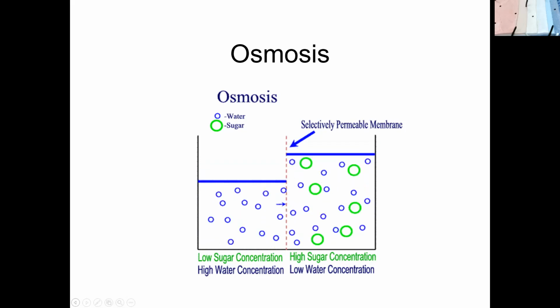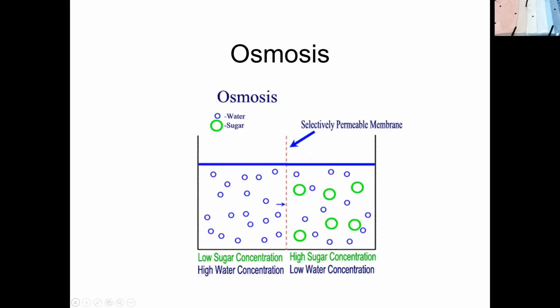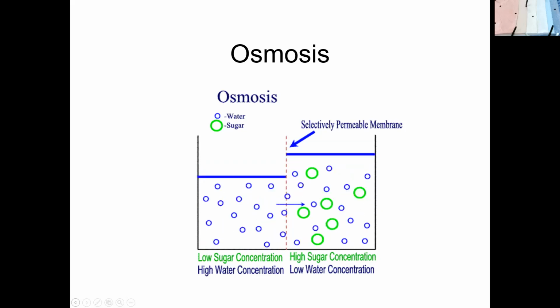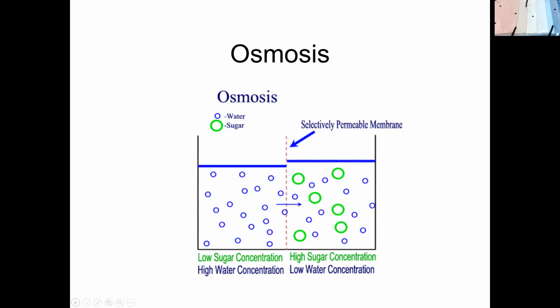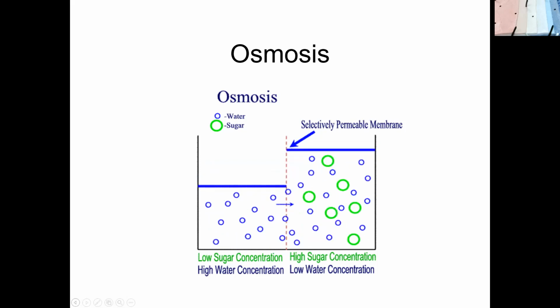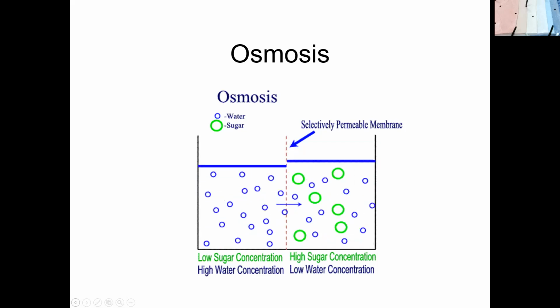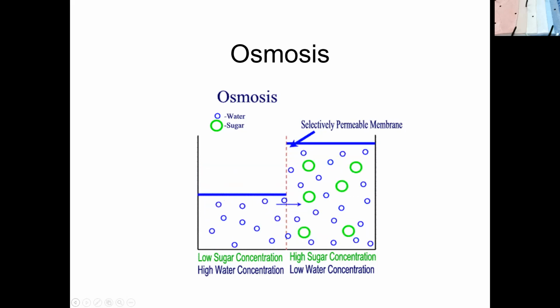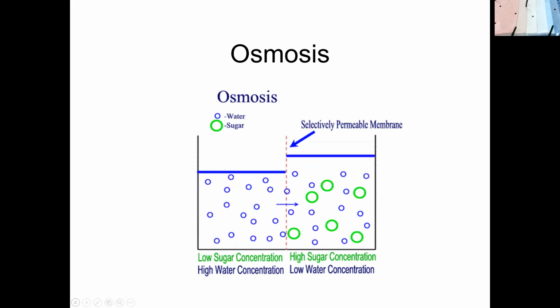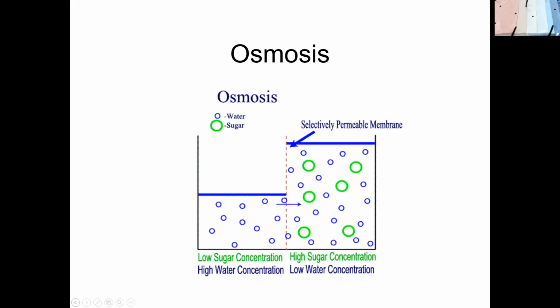Now the artificial cell is made from what we call dialysis tubing, just like you use in dialysis equipment. This stuff is very thin. It also has lots of little tiny holes in there you can't see. So we can create an artificial cell. Now in the beaker with distilled water, there's an artificial cell containing 10% sodium chloride. So I filled up the cell, pinched it off, and put it in the beaker of distilled water. What's in the cell is 10% sodium chloride.